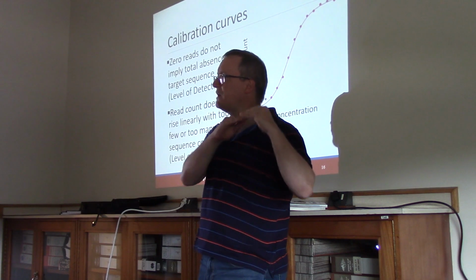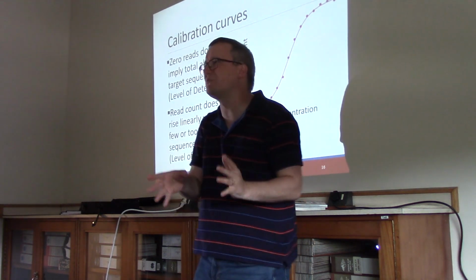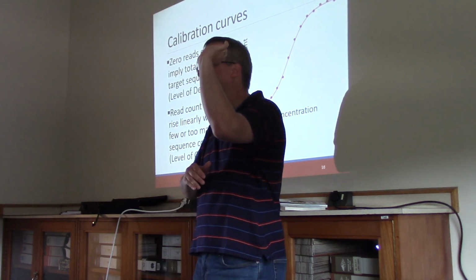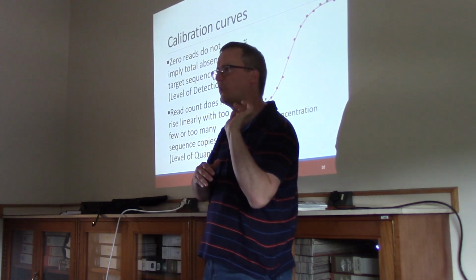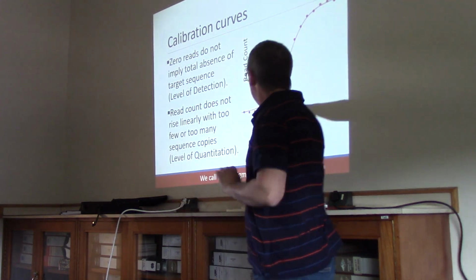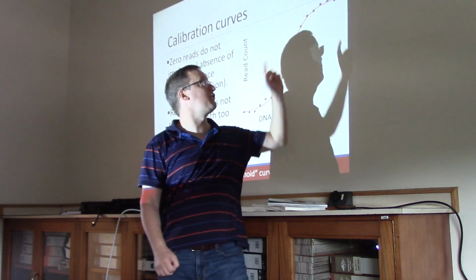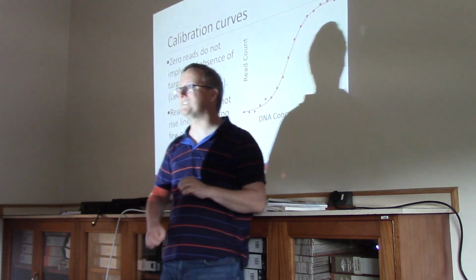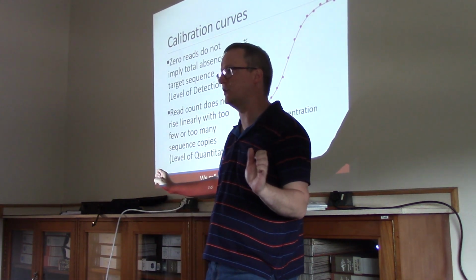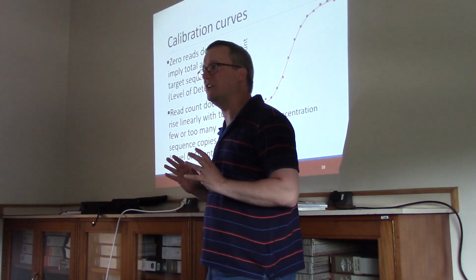But we also have this problem of attenuation at the high level, that the number of reads doesn't really grow if you have, say, 50% of the population being a species versus 40%. I don't know where those limits are. So we have problems of detecting something that's very rare and of quantifying something when it's present at a really high level, because it's basically blasting out everything else at that point. Both of these problems are things that we need to be thinking about.